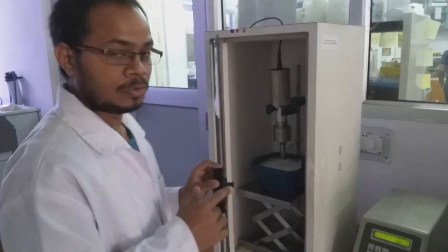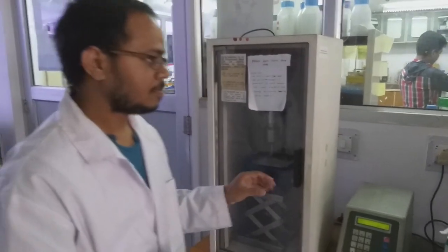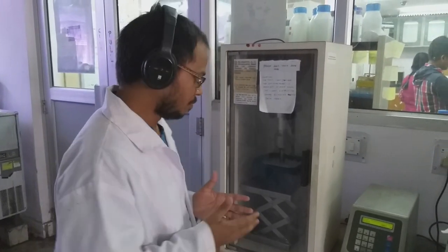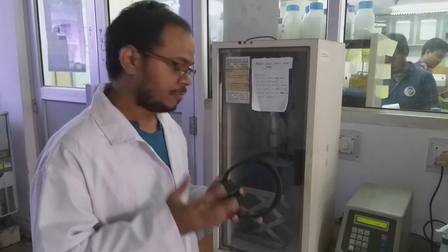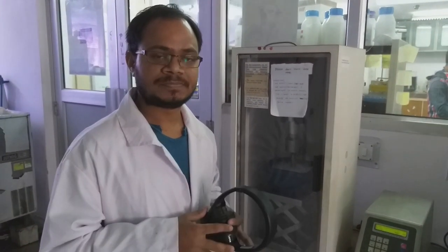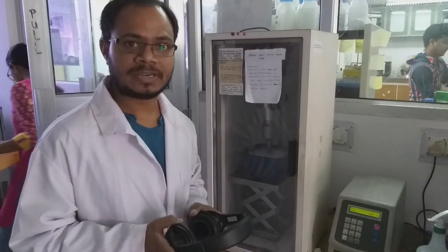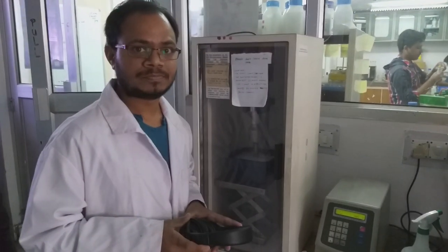So while sonication is going on, you have to properly close the door. If you are standing there, you have to use headphones, so whatever sonic waves are coming will not affect the ears. Sonic waves are very powerful, and the most affected organ in our body is the ears. So it may affect internal organs. So it is better to wear headphones while sonication is going on.